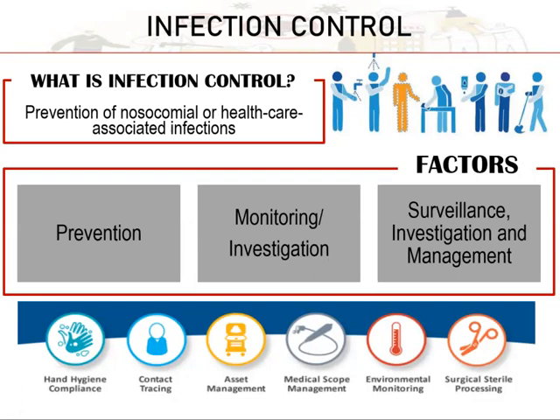The next one, if the infection is not prevented, is monitoring and investigation. During monitoring, we are going to identify the source of infection.